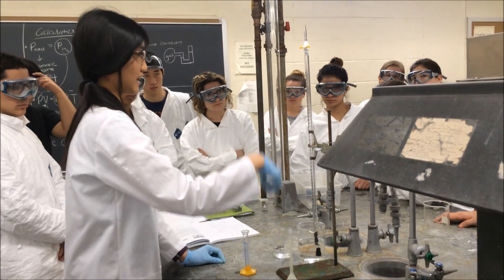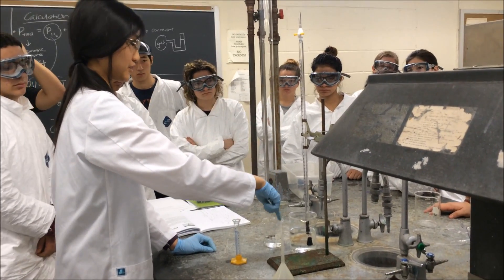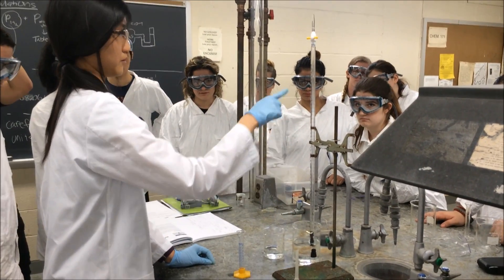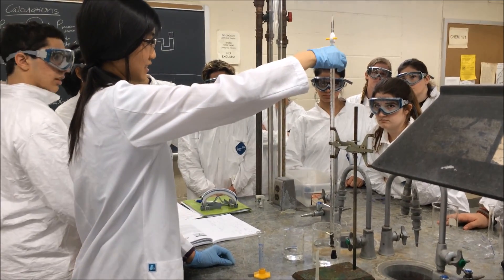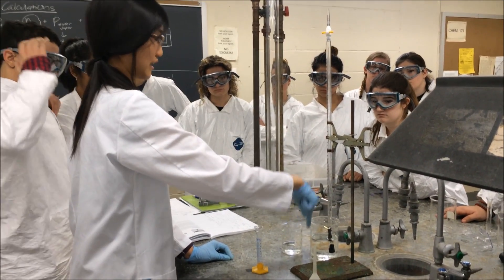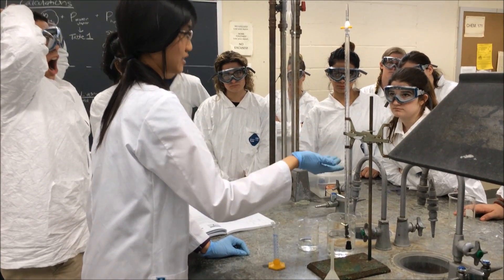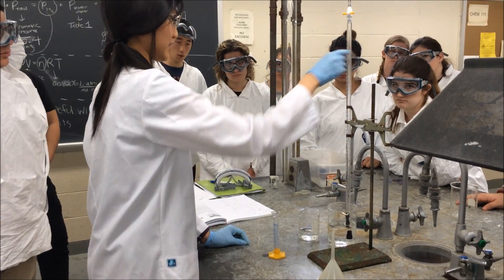Once you invert it, the acid that was at the top will start slowly moving downward. Once it reaches the metal, it will start reacting and you'll see bubbles forming. Those bubbles will rise to the top of the inverted burette — make sure the stopcock is closed again. The bubbles will get stuck at the top and start pushing water out into the beaker. That's why you don't want the beaker too full, because it could overflow when the water displaces into it.